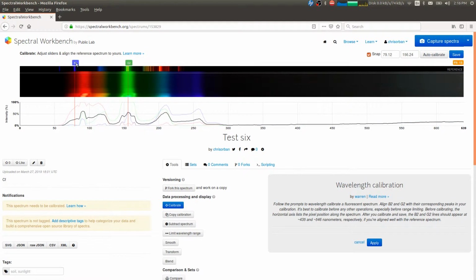And so you might think, okay, well, all I've got to do is drag this blue over here to calibrate, but then it's still over here, this blue line. That doesn't actually seem to work. So the answer is we have to flip the spectrum. We need blue to be on the left and red to be on the right. That's what we're supposed to do, and unfortunately the directions don't tell us. There's not a whole lot of things that address this directly.